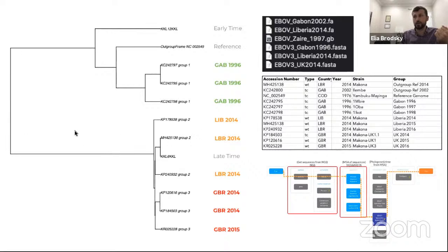Looking at the x-axis, we can consider evolutionary time. The process of getting such information from sequencing data is alignment, conversion to amino acids, and then what's called phylogenetic tree reconstruction using multiple sequence alignment based on multiple types of models. And we'll talk about that in greater detail.